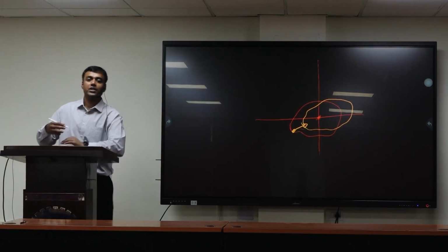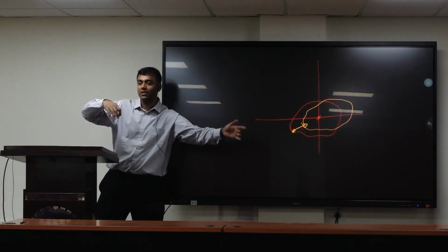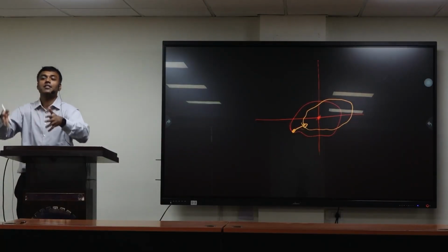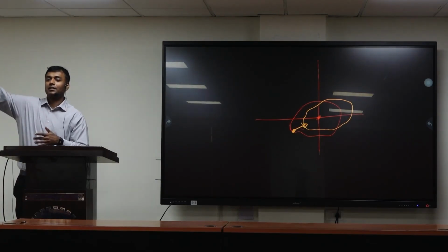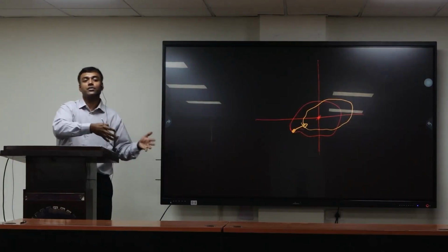So the high frequencies, which were previously lost because they were outside your diffraction limit, outside the range, have come. You have shifted it so that they are inside now. Some of the low frequencies have gotten out, but the low frequencies went out while the high frequencies came in.